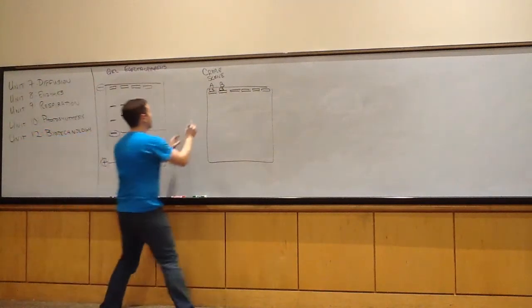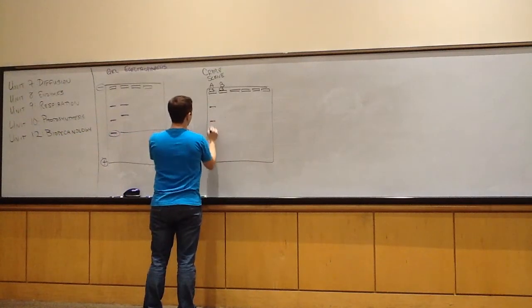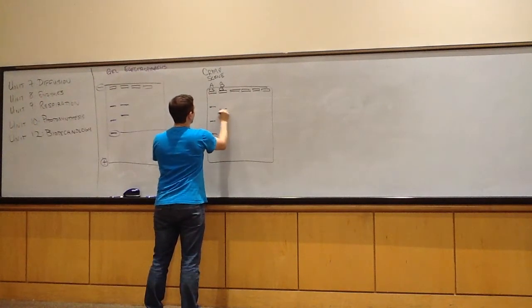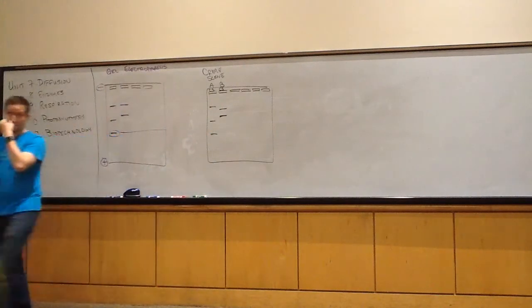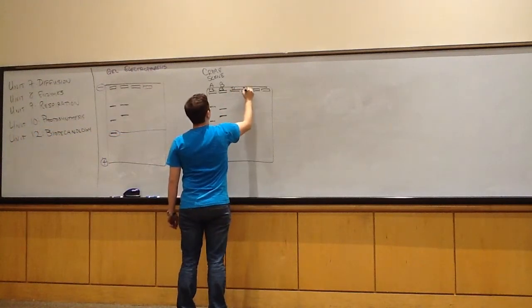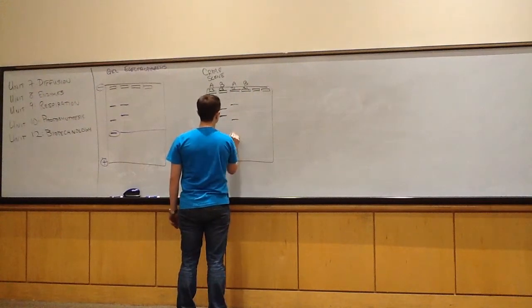And let's say the crime scene DNA gives us this pattern. So we'll go off of what I did before. We'll get three bands there. Let's say with B instead, we get something like this. Okay? All right, so now let's do suspect 1's DNA. Digest it with enzyme A and enzyme B. And let's say for enzyme A, I get this.